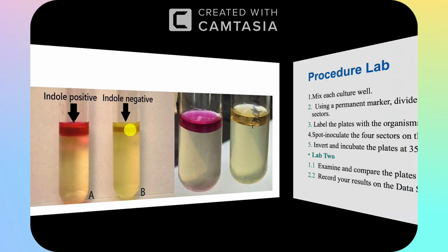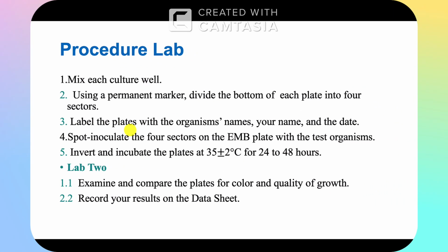This is our practical test. To do the inoculation, we are going to work together in a group. You will have 2 media of EMB, and you will inoculate by the loop on the media E. coli and other bacteria of Enterobacteriaceae like Klebsiella and Proteus.